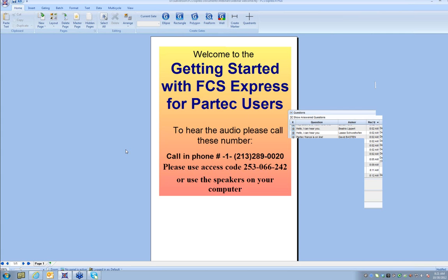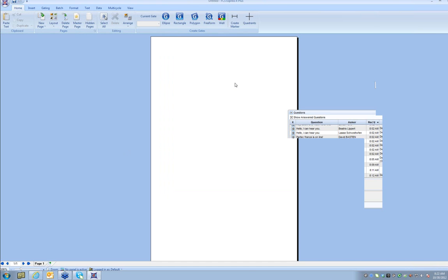So FCS Express itself. The idea behind FCS Express is that it is a data reporting and data analysis software at the same time. So the idea is to give you all of your data analysis capabilities that you need, all the quads, all the gates, all the plots, everything, and also give you all of the reporting capabilities that you need, because in today's science, you can't just simply go out and get plots and do things. Presenting, gathering and reporting that data is also very important. So I'll show a little bit about how that works.